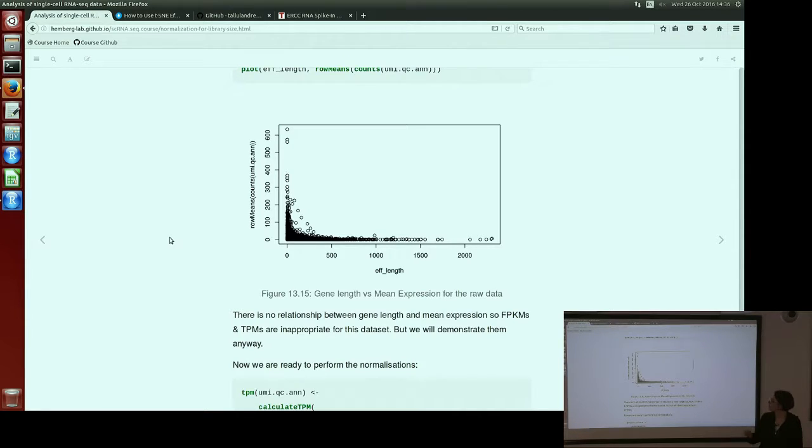However, I'm going to put a lot of stars at the end of this because even for whole transcript sequencing, we saw earlier that you get a very strong bias towards the 3' end. So the actual length that you're sequencing is not the same as the transcript length you'll find in the database. So it gets very complicated to correctly normalize for gene length in these data sets. So we sort of recommend you use Cufflinks or RSEM or Kallisto or some mapping or quantification algorithm that will actually look at where your reads are mapping when it's calculating the transcripts per million, as opposed to trying to just, after the fact, normalize for it.